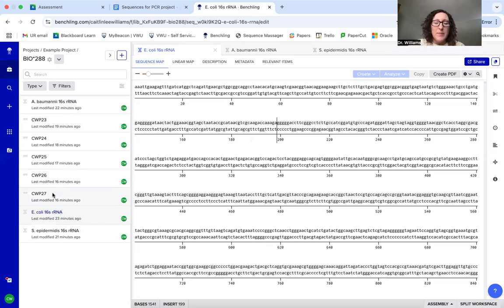All right, so the next step is to attach the primers to the DNA sequences where they match. And this is a really powerful thing that the computer is able to do for you, right? It's essentially doing that needle in a haystack search very quickly, and it's going to say, these primers will stick and it'll show you where.